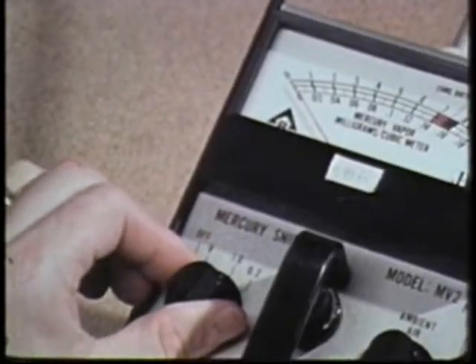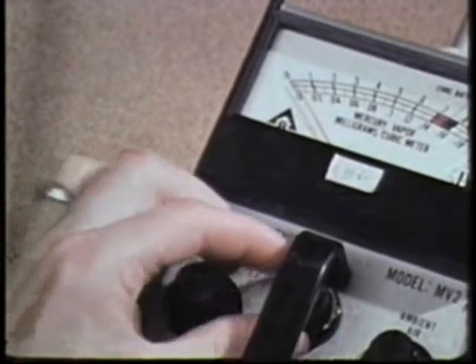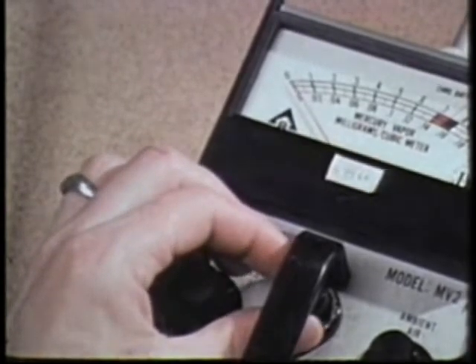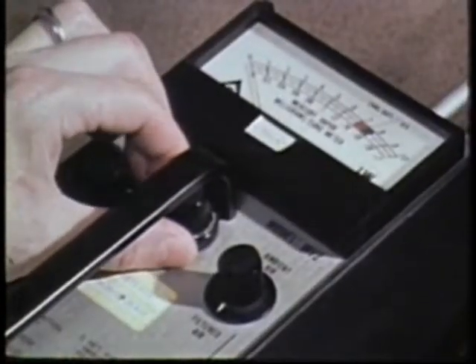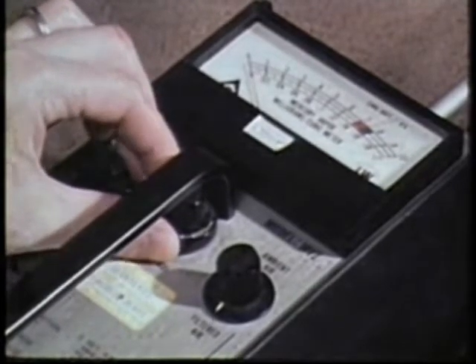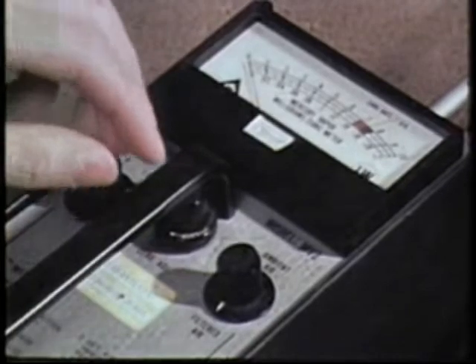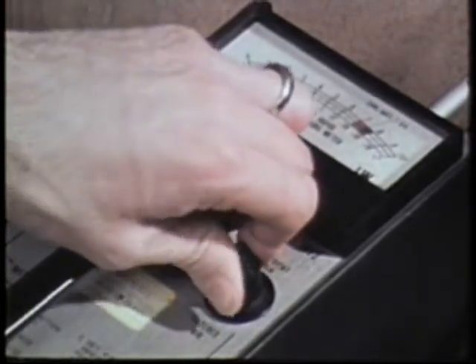Then switch to the 0.2 scale and zero the meter again. Secure the locking clutch. Then shift to the ambient air setting to take a reading.